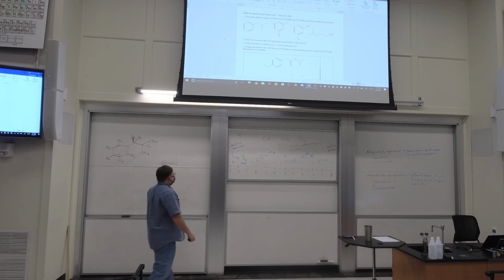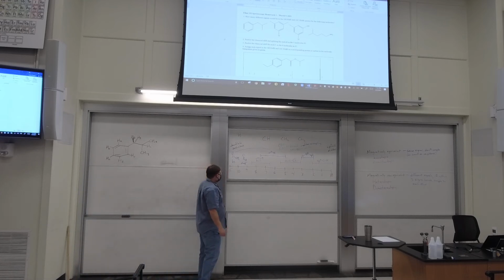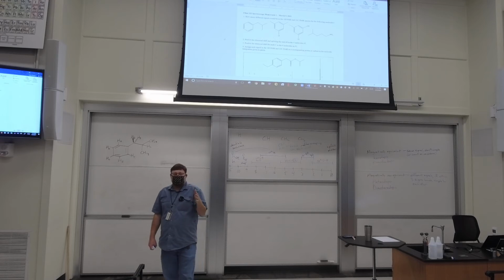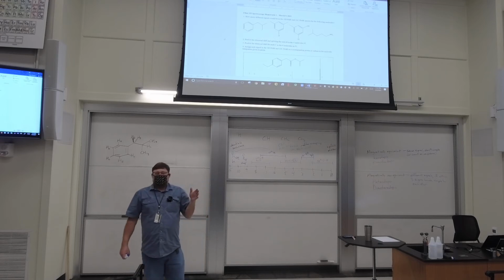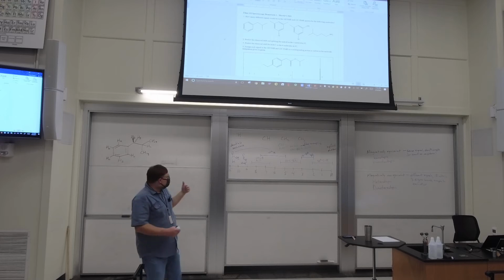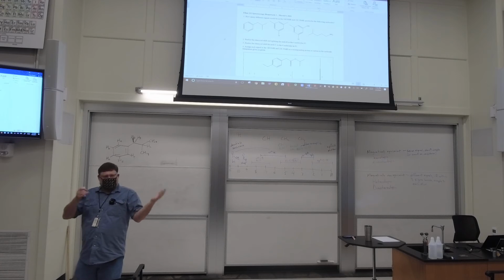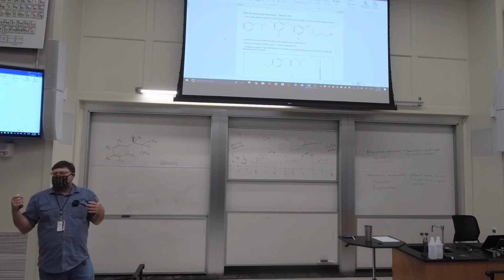All right, so OH is way out downfield to the left. Aldehyde protons, that's an H bonded to a carbonyl. That's going to be a much sharper signal because it doesn't hydrogen bond. But it's still bonded to a partial positive carbon, right? Downfield, what everyone calls de-shielded, means that the electron density in the bond the proton shares is pulled away from it.